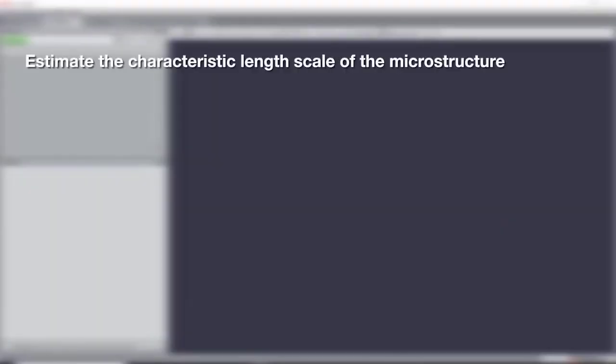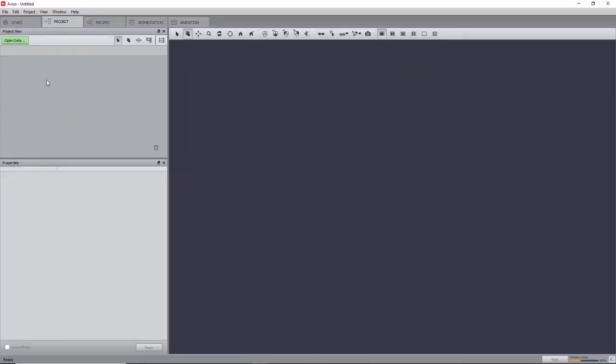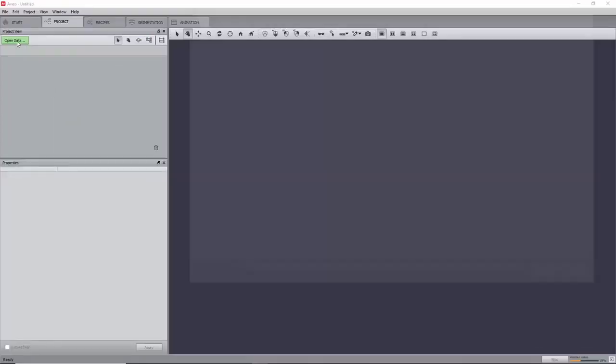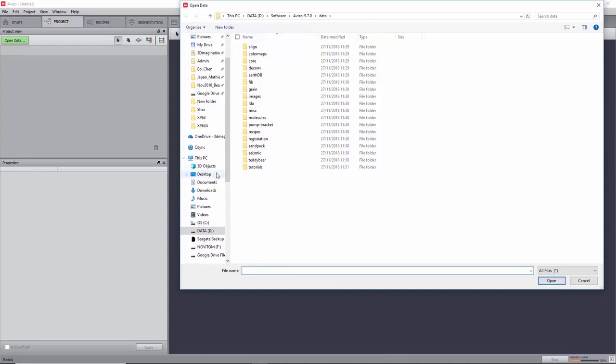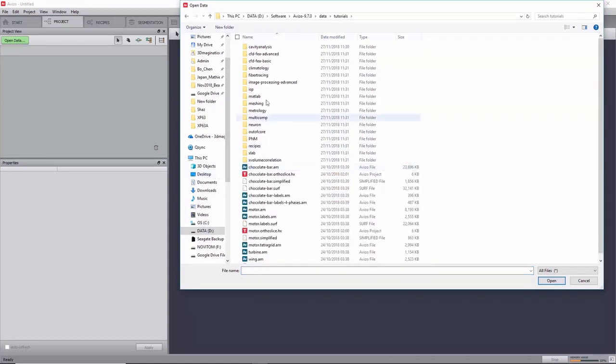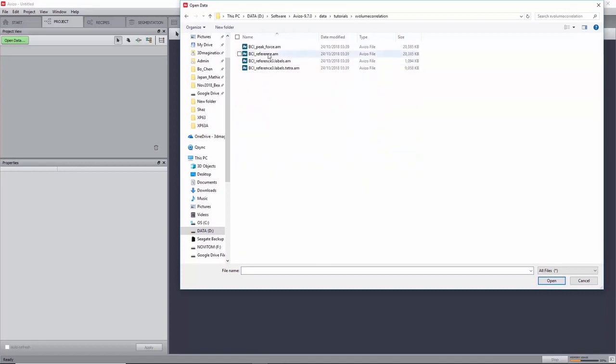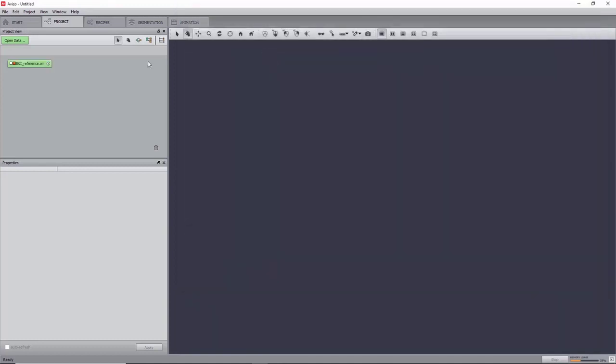The data in this tutorial is courtesy of the University of Portsmouth. We will start by loading bci-reference.am, which can be found in the folder Data, Tutorial, X-Volume Correlation, and will refer to it as a reference.